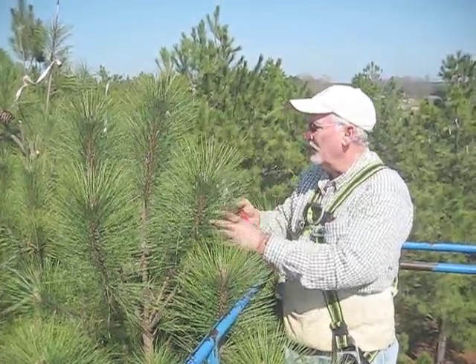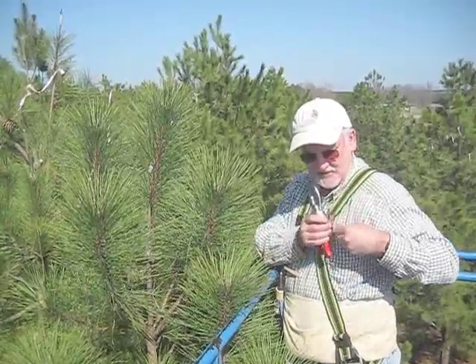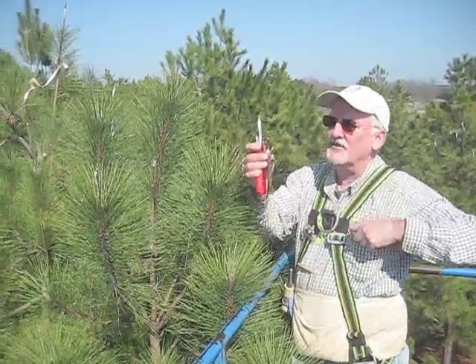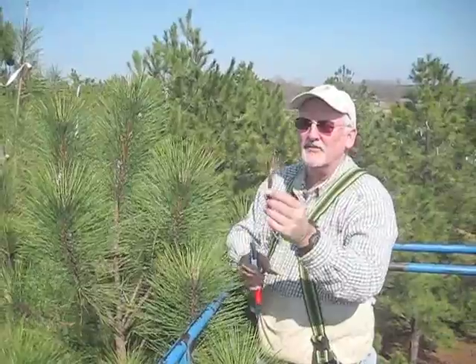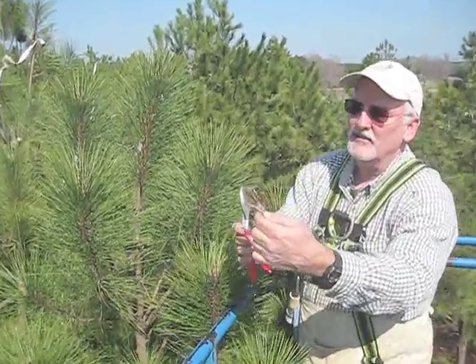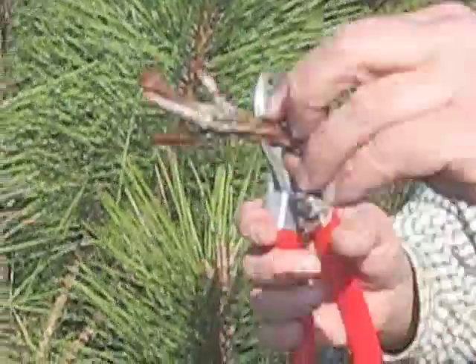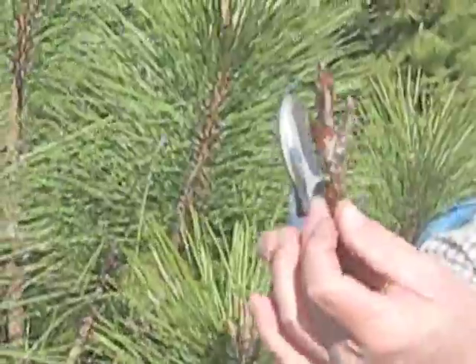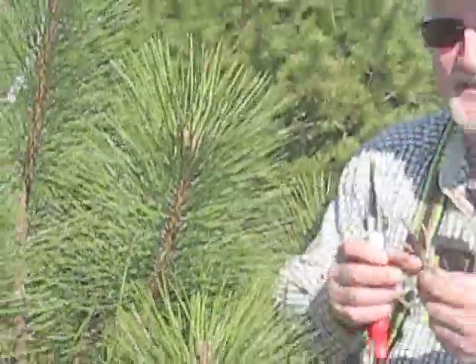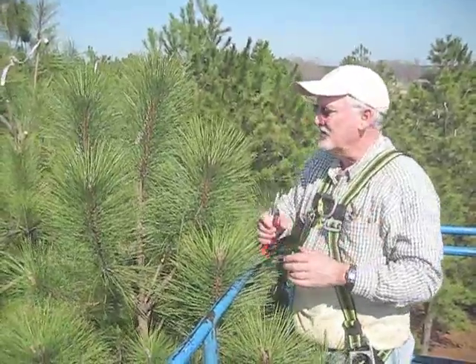I'm going to start with this tree right here. What we do is we take cuttings — scions — off of select trees like this. This is a healthy, vigorous scion. It's already been dipped in wax; you can see the paraffin, melted at about 190 degrees Fahrenheit, dipped in very quickly to seal it up and prevent desiccation. And that's the key throughout the grafting operation: prevent desiccation.